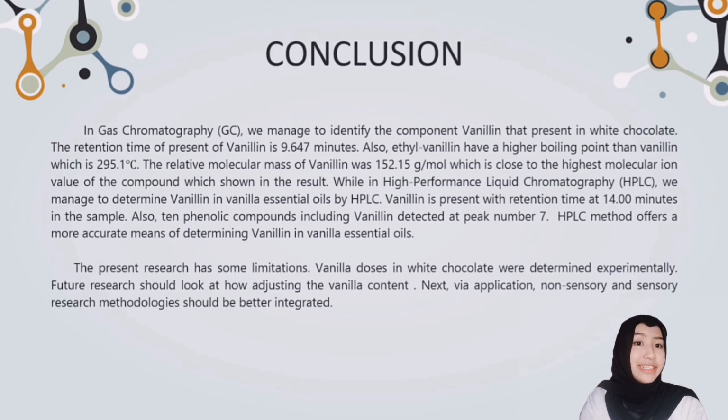The present research has some limitations. Vanilla doses in white chocolate were determined experimentally. Future research should look at adjusting the vanilla content. Next, via application, non-sensory and sensory research methodology should be better integrated.